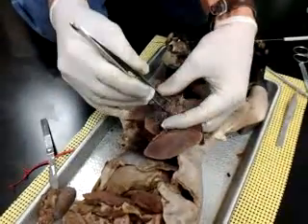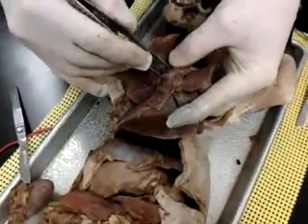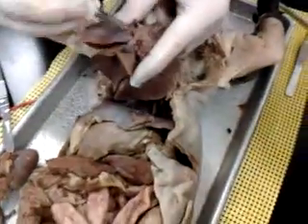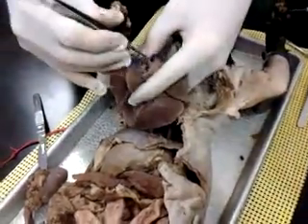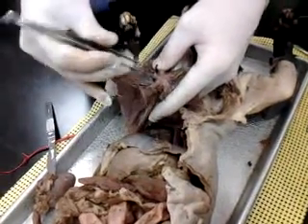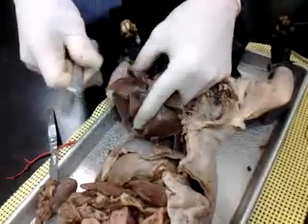There's the primary bronchus, again, right here on the left and right here on the right. Now, if you follow primary bronchus out, of course, there's one primary bronchus on each side, but it's going to have to split to go into each lobe, and the branches are then called secondary bronchi.